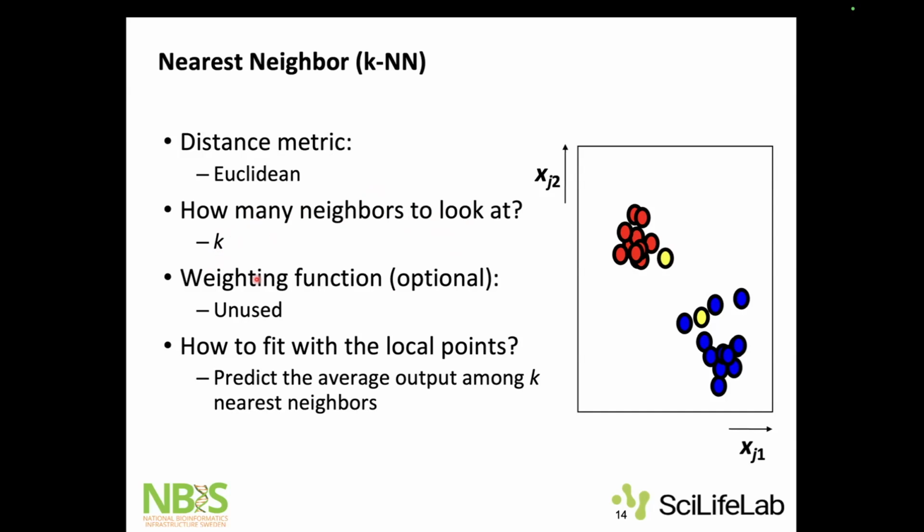You should also keep in mind that this k is used for the whole classifier. If you have unbalanced cell populations and you use a very high k, it's going to get very confusing for those small classes. So it's very tricky to know which k you need to choose.